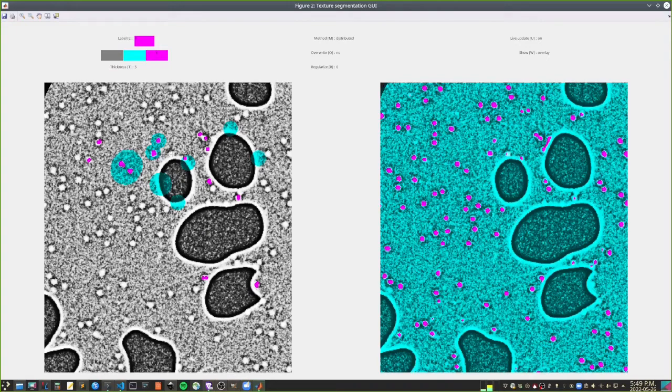Also, what the tracking helps with is the fibers that are adjacent to pores. You're not sure because around the pores there's this white halo, so if there's a fiber there, it's not really that clear. But if you look at 5 or 10 slices beyond, the fiber might diverge a little bit. So by tracking, you can find those and complete some of the picture. That's one of the strengths of the tracking.